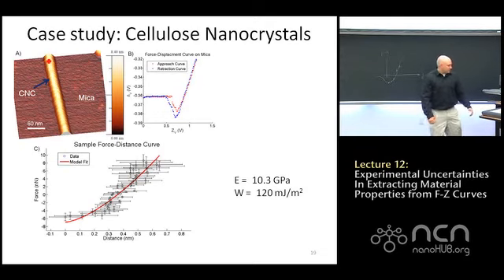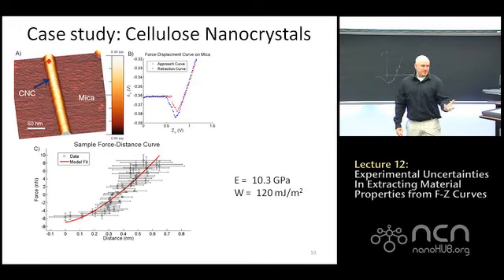And the distance in that plot is really indentation? Yes, it is indentation. I've always been confused about what the best word for this is, because before contact you have gap, right? And after contact you have indentation. I've kind of been using distance as both of those. One can debate what the best way to go about it is. But yeah, if you want to call that indentation, that is indentation.